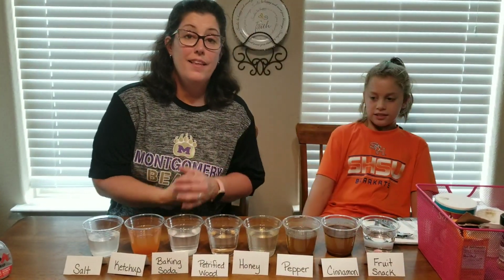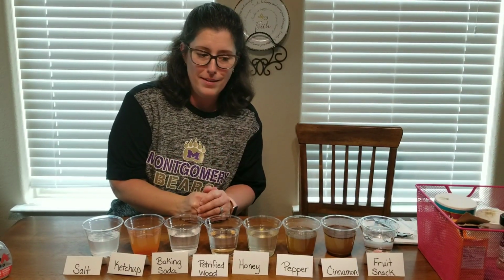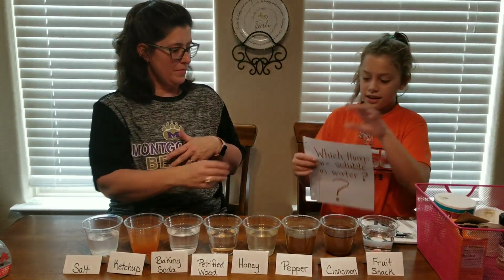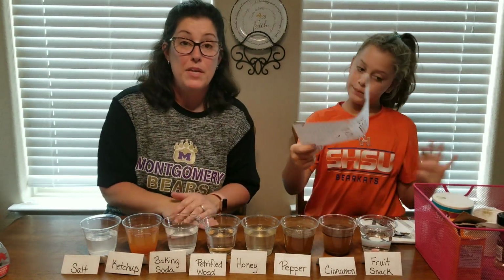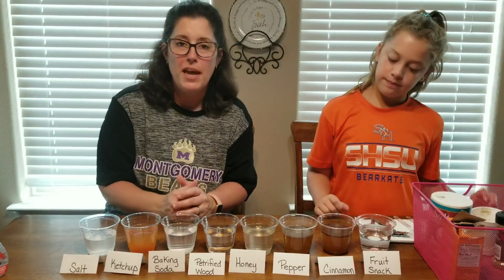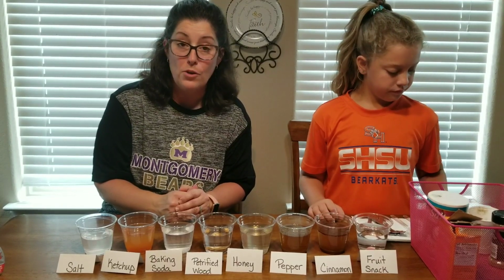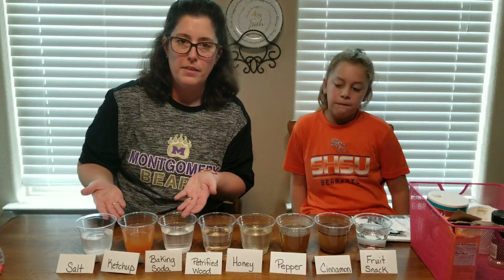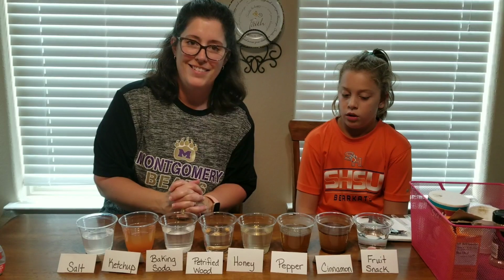All right, friends. Thank you for joining us today in our lab where we did what? What did we learn? Which things are soluble in water? All right. Be sure to check out the pictures that I'll be taking throughout the afternoon to see if we have any additional changes to any of our substances. And also, if you haven't done so already, take a look at the labels and come up with your own hypotheses. Did they dissolve? Are they soluble? Or are they not? Or will they dissolve?